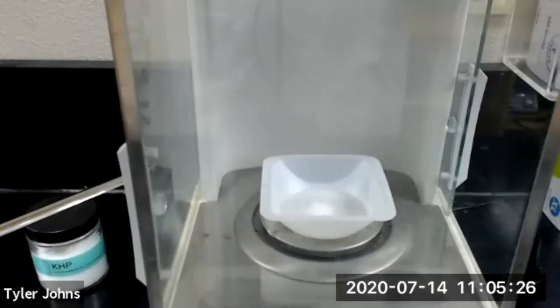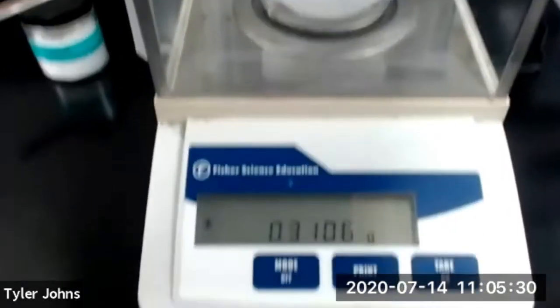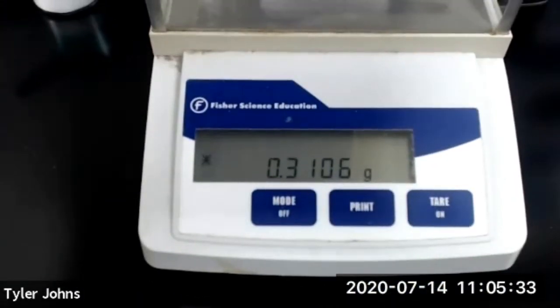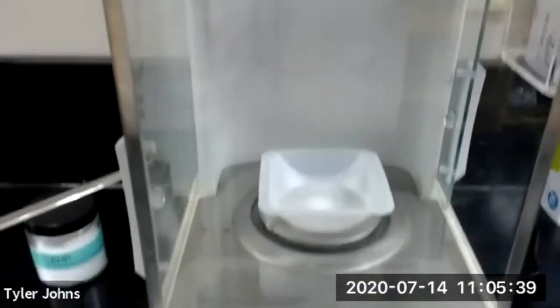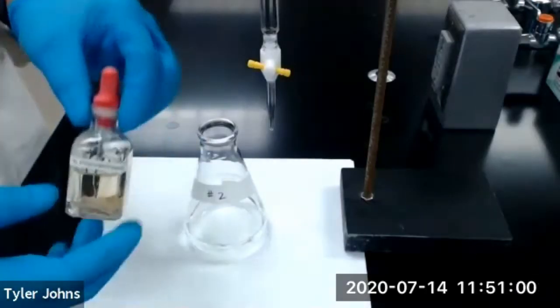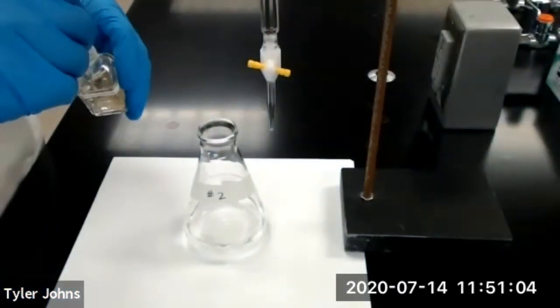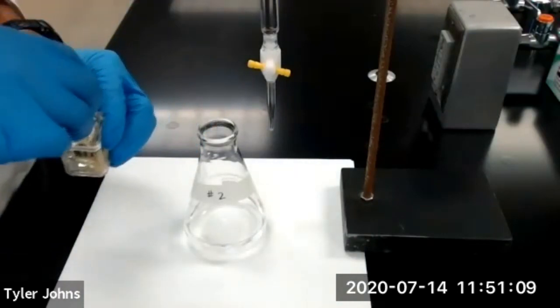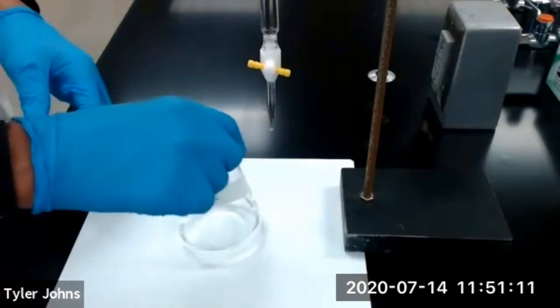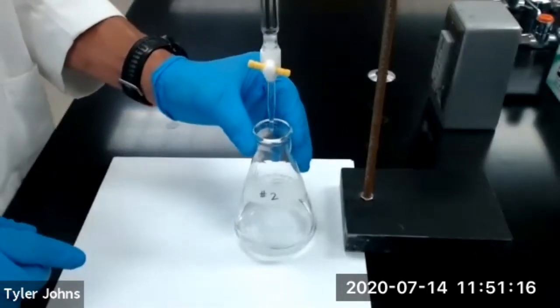The mass of KHP that we will be using for trial number two is 0.3106 grams. We'll now add 3 drops of our 1% phenolphthalein indicator to our Erlenmeyer flask for trial number two, and we'll begin titration for trial number two.